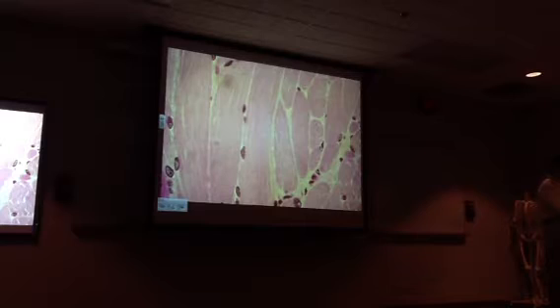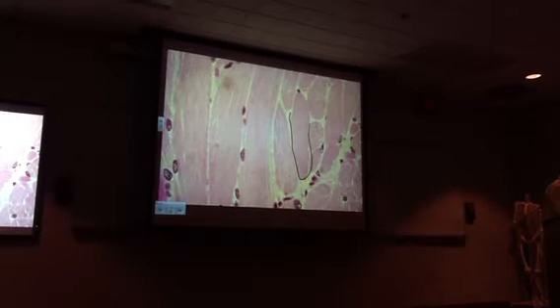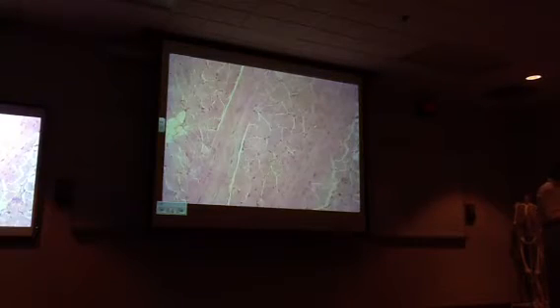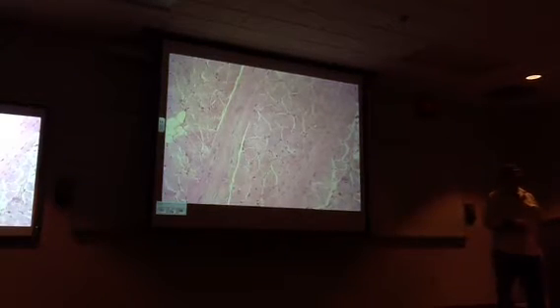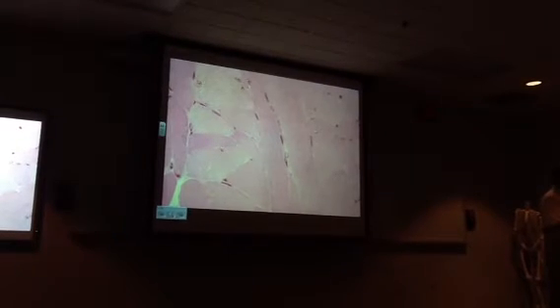Once again, you would be defining endomysium. Same thing, just skeletal muscle. Okay. Same thing, just skeletal muscle.